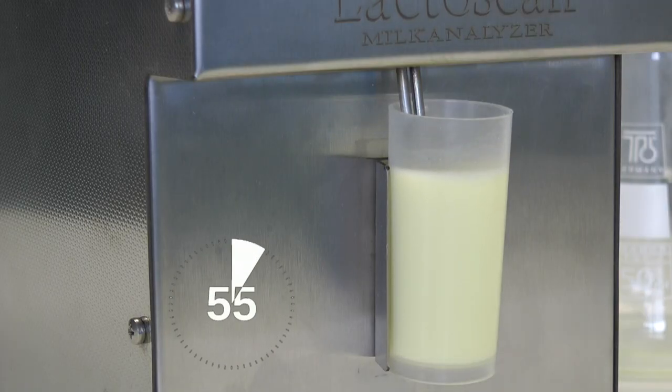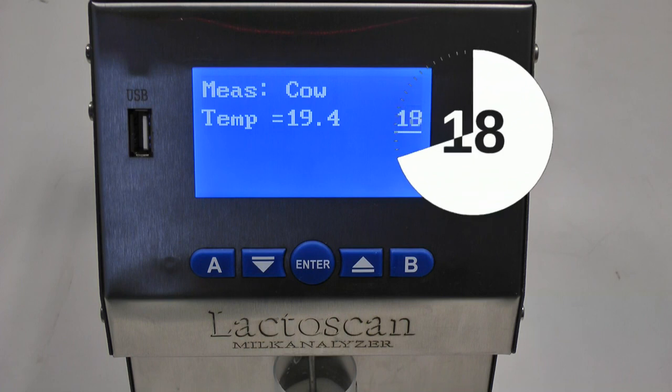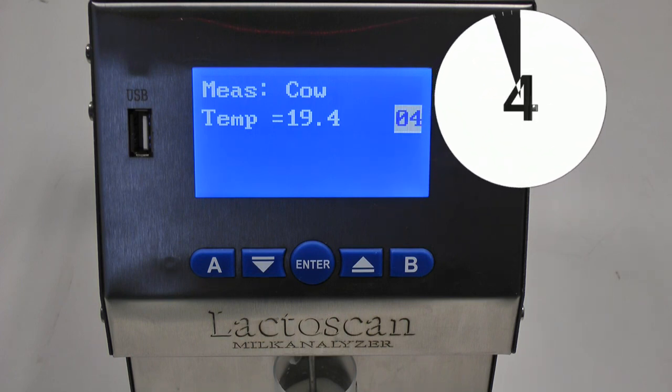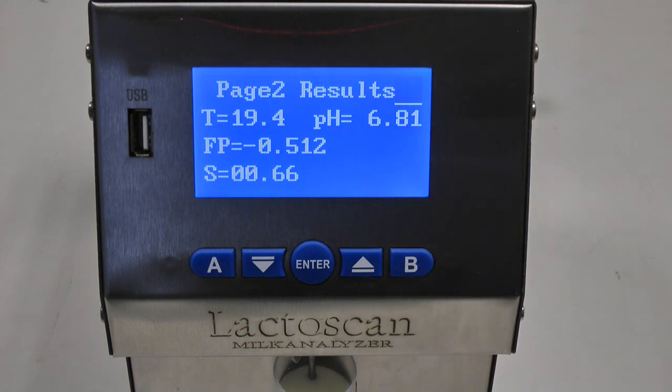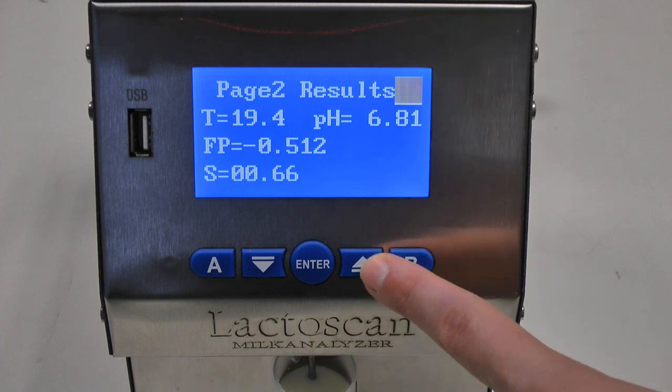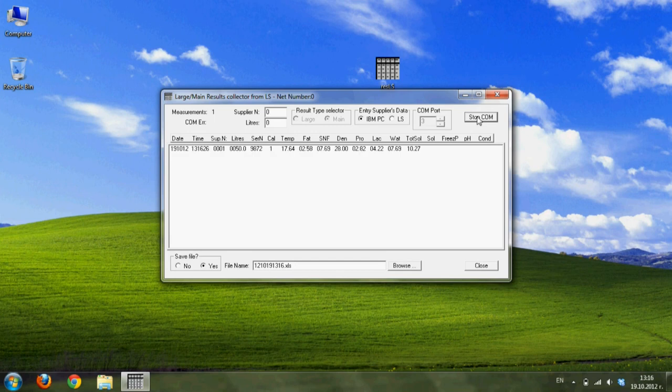The analyzer sets the milk, makes the measurement, and returns the milk in the sample holder. The first message appearing on the display is sample's temperature. Ignore the first results after switching on the analyzer and when using distilled water. Make second measurement with new portion of the same sample. Results are displayed on three pages. By pressing the buttons up and down, the operator has the possibility to pass from one page result to another. Results remain on the display till a new measurement is started. They are automatically printed and saved on a flash drive. If the analyzer is connected to a computer, it sends the data to the computer.